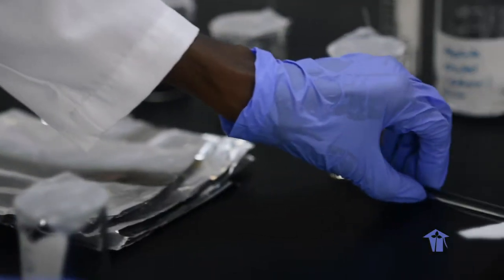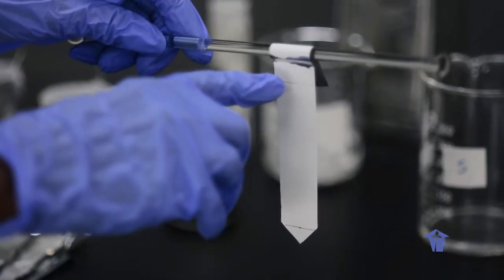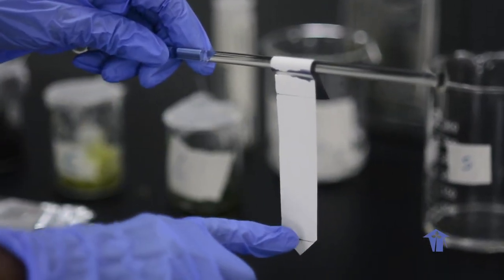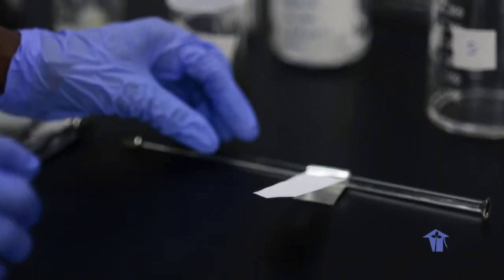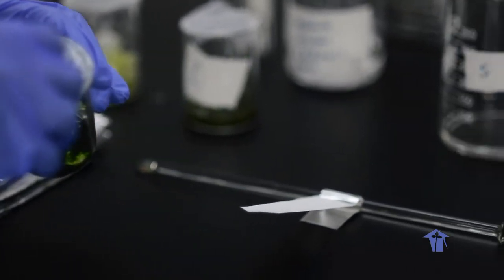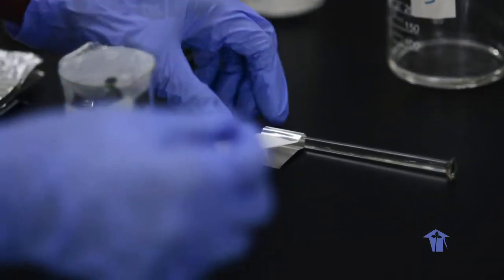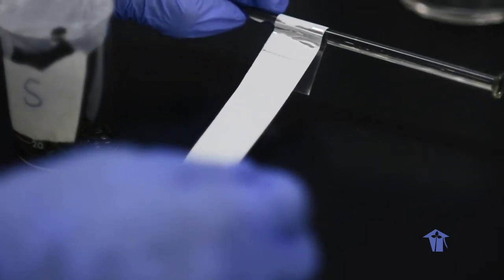On my chromatography paper, you'll notice I have drawn two lines. This first line is the area where I'm going to put a drop, or a few drops actually, of my spinach solution right at this point.